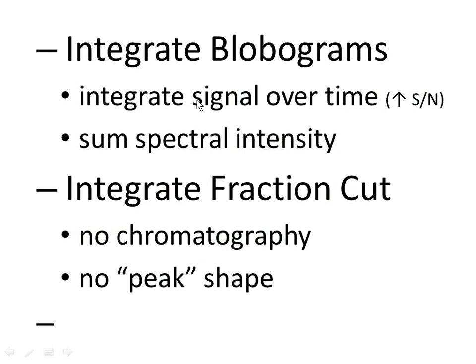So one scenario is that you want to integrate the signal over time so that the signal rises up out of the noise. And you can think of that as summing individual spectra together to yield a total spectrum, or spectrum summation.